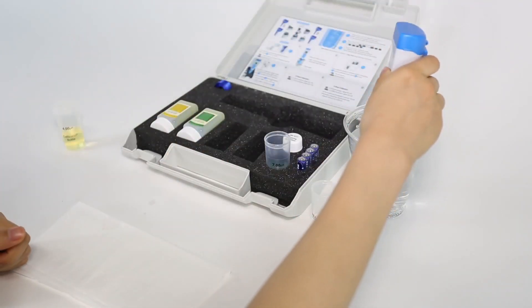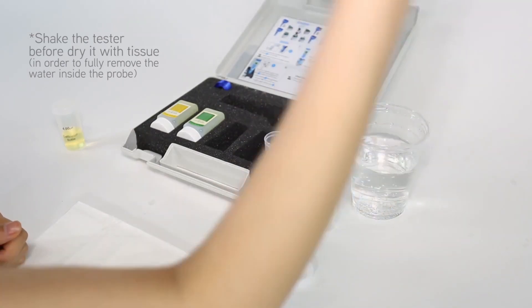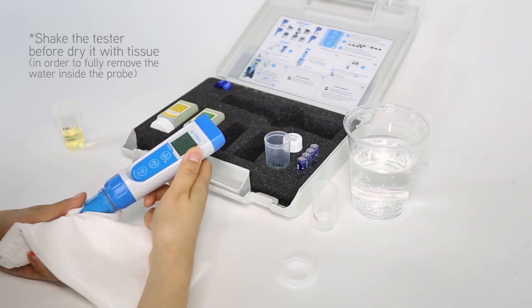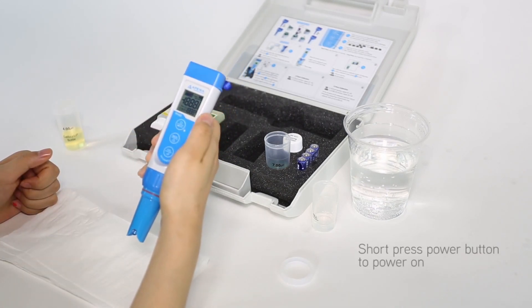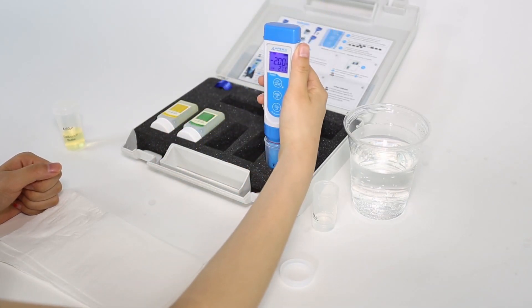Clean the probe in distilled water and dry it. Short press the power button to turn on the tester. Dip the probe in the 7.00 calibration solution.